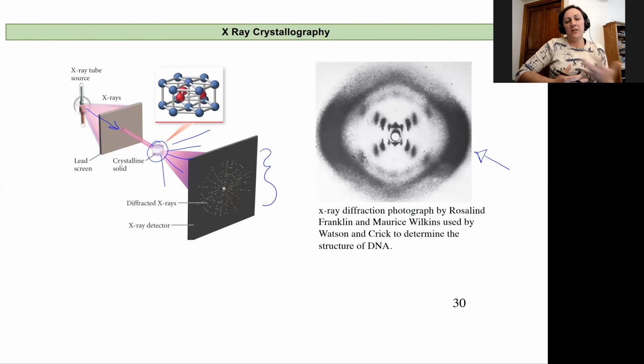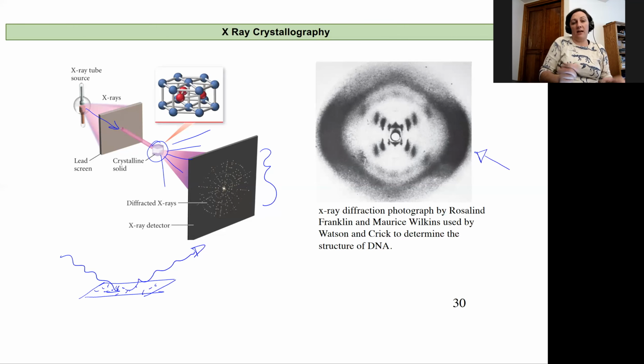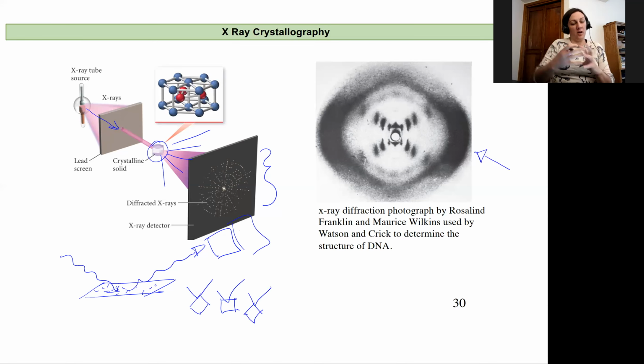X-ray diffraction. There's also something called powder X-ray crystal diffraction, where you take that crystal and you grind it up. And you create a fine powder on a slide, and then you shoot X-rays at the powder and have them bounce off and collect them in a detector. And in this case, if you ground up a crystal, as a human can grind it, it's not going to be totally pulverized. You'll have different faces of the crystal structure that'll be struck at different angles. And so then you'll take that data and try to work backwards to figure out what the structure was.